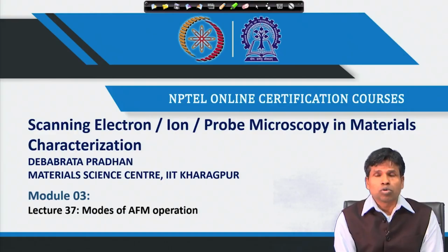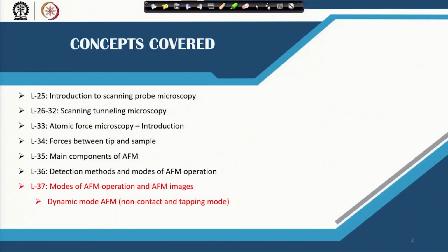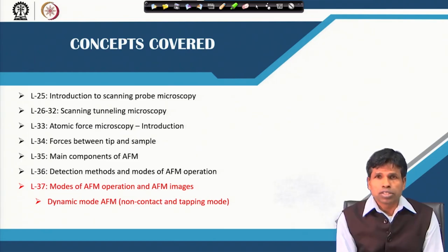Welcome back to our NPTEL course on scanning electron ion probe microscopy in material characterization. We were discussing the different modes of AFM operation. In that part, we have already discussed the contact mode of AFM, which is a static AFM. Today, we will discuss the dynamic mode of AFM operation, which is the non-contact or tapping mode of AFM.